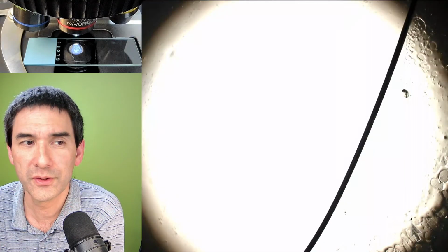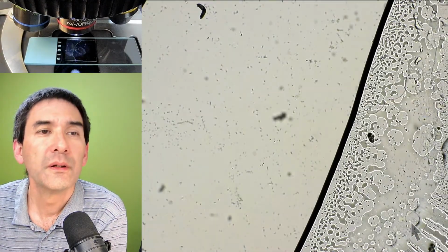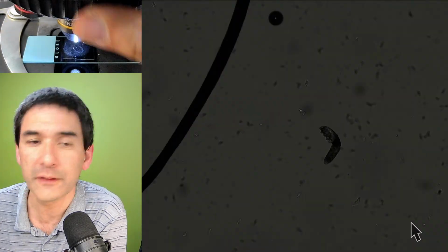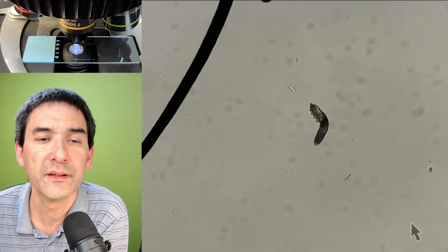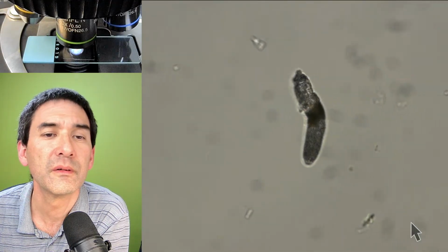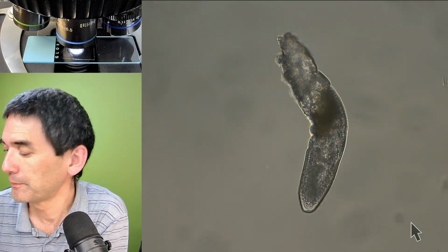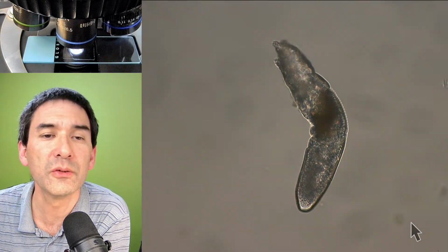It takes some time for it to... Okay. Yeah, here is one. This one is still pretty much there where it used to be. So let's go up now with the magnification. It's a little bit now still from the side. So 20 times. Okay. And 40 times. DIC. Let's see if this adds anything here. Not a lot actually.